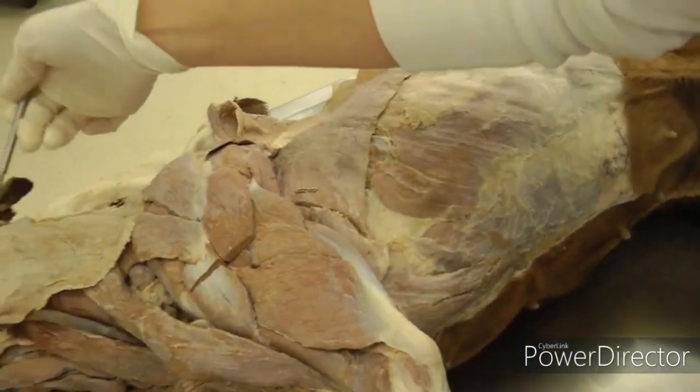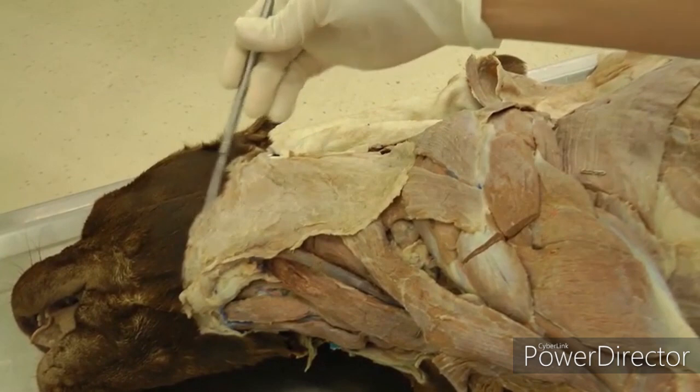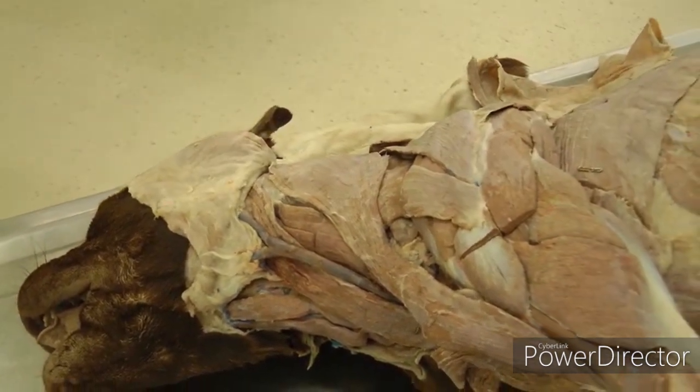You're also going to have the cutaneous muscle which is the platysma in the neck. We won't cover that until later in the dissection labs, but you want to flip that forward off of the muscles you're going to look at today.